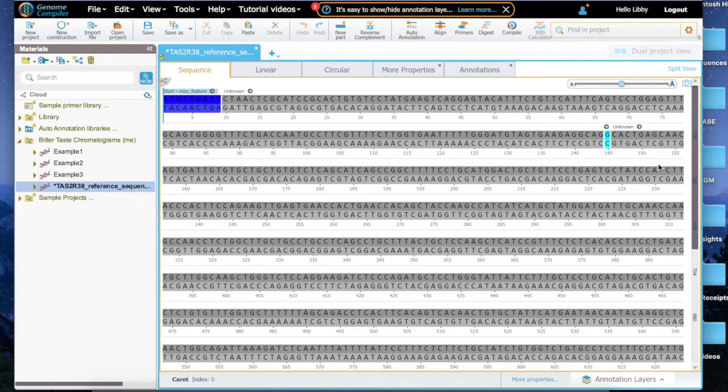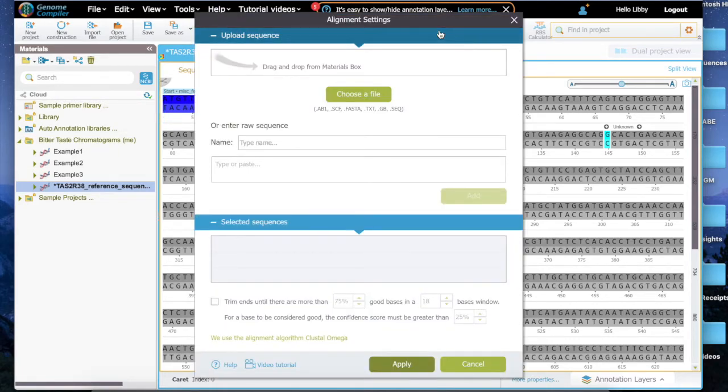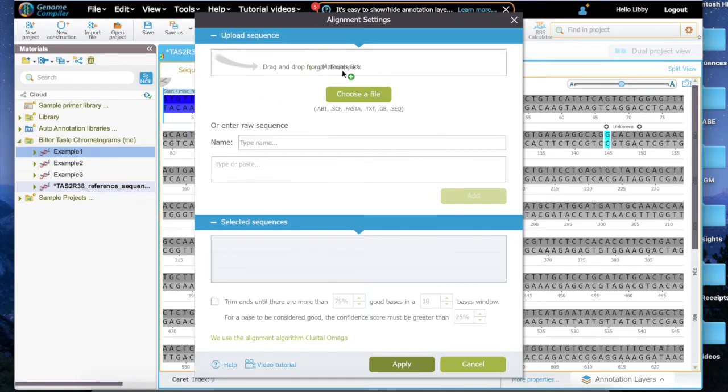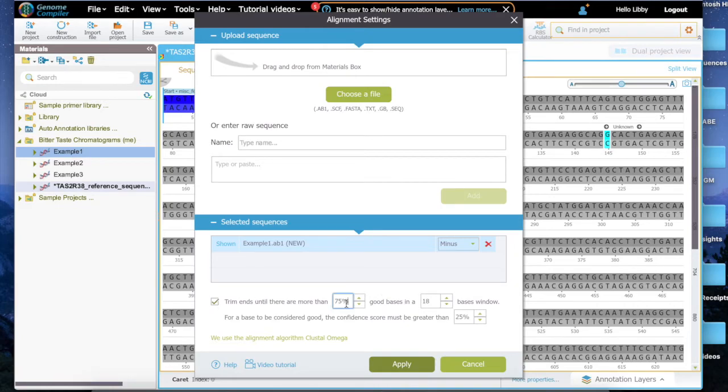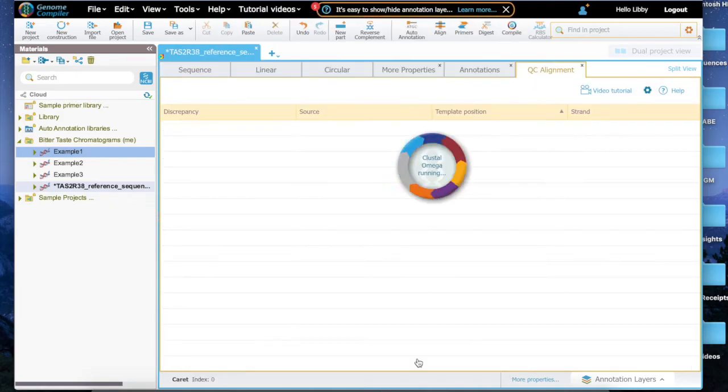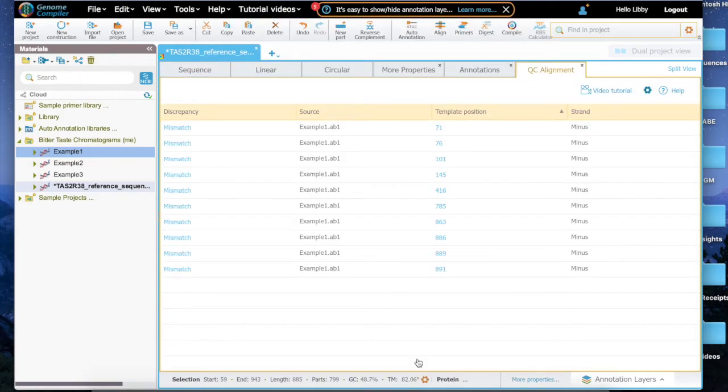We'll be comparing this to the 3 to 5' strand of our example sequences. Click the Align button to select the sequence to compare to the reference sequence. Drag the sequence into the box. Before clicking Apply, we'll want to mark any bases that the computer is uncertain about. Set the bottom boxes up as shown. Then click Apply.